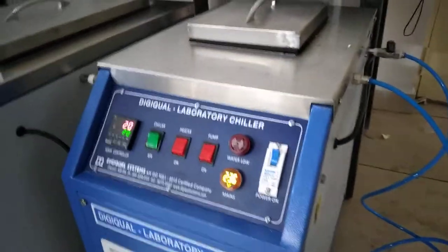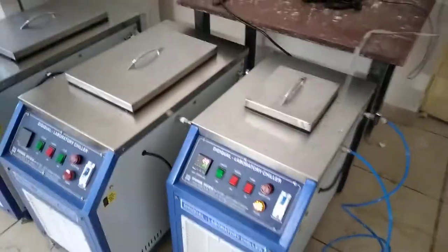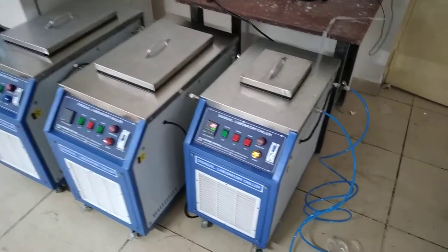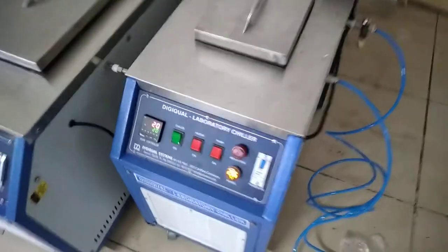This is a 5 litre chiller and the next one is a 25 litre chiller. So we can see the number of chillers. The 5 litre chiller is switched on now.